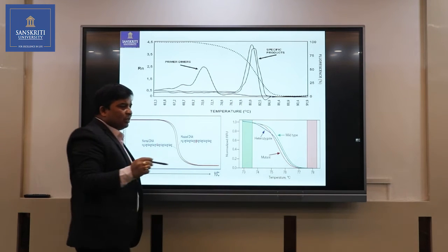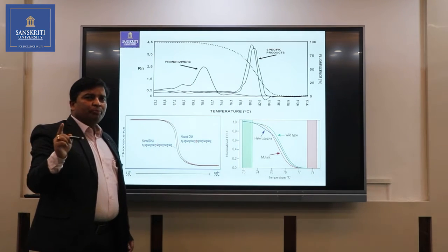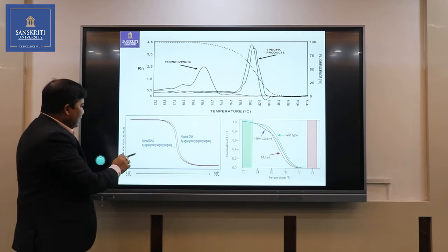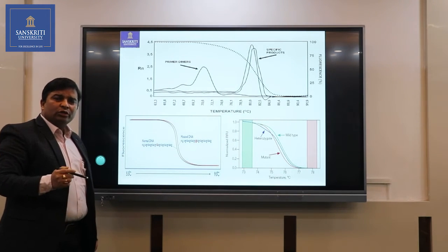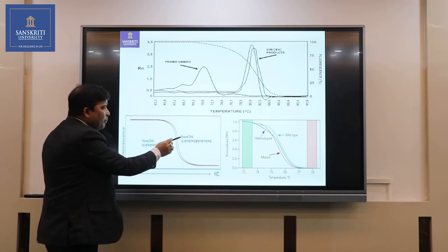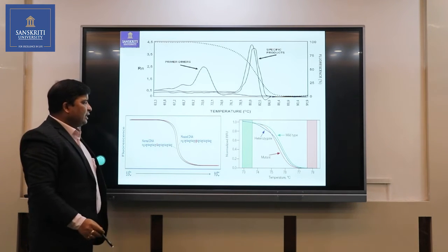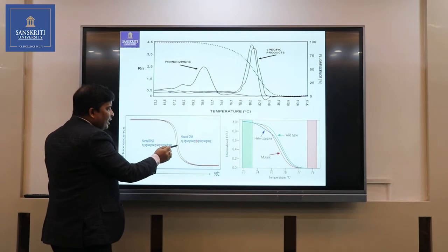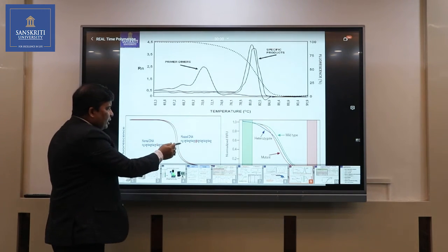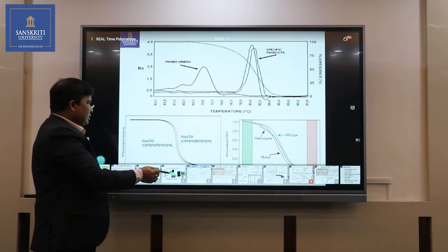But in a specific product, we can get all the melt peak at the same temperature. Here we can see that there are two types of DNA we are using for the amplification. One template is normal and the second template is mutated. If GC content is high in mutated DNA, then we can get slight shifting of the melt curve in the mutated DNA case.